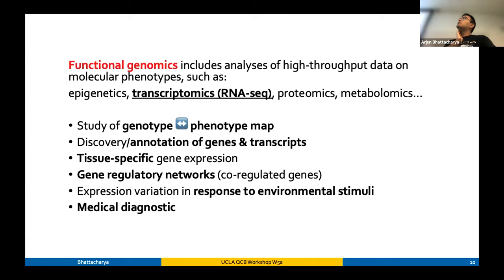Yes. A question back on proteomics. Is it limited by starting sample size? Is it more proteomics than on the... It's more so the quantification. Actually, the more I think about it, it's more so that I think the technology is just not as cost efficient as for the high level high throughput that RNA sequencing gets to. Like I said, I'm not sure how much longer that's going to be true.